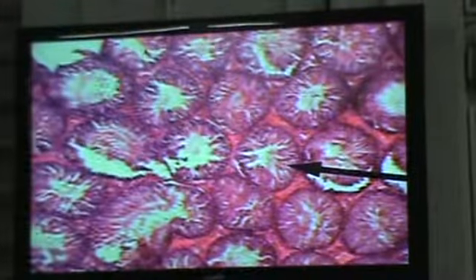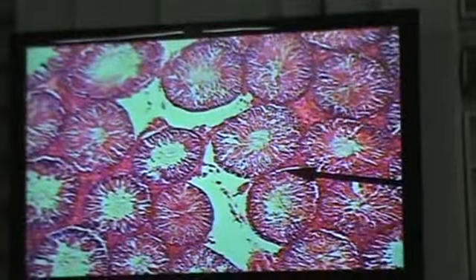I think I pulled up a beautiful slide yesterday. Really good. A fantastic slide that I found yesterday. And we're demonstrating it. But unfortunately, I will let my colleague take it out. Okay, just looking right here. So this is another testis that we're looking at.